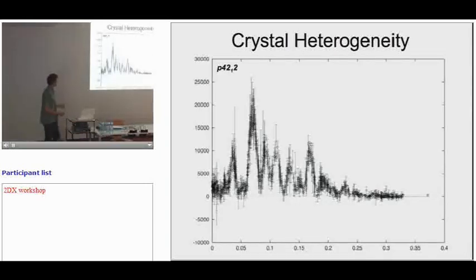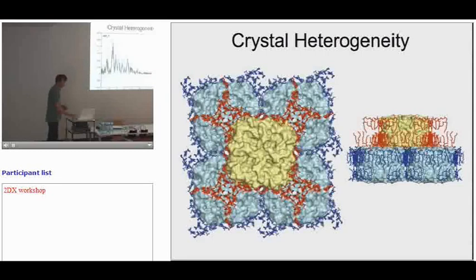And so this is what the merging lattice lines look like at the end. We're going to have a session on diffraction merging, I think Thursday, where you'll be shown how to actually make these lattice lines. But you can see how much better they are, that there's actually a modulation of the intensity with respect to resolution, whereas before it was just a smear. And then this allowed me to build this atomic model using molecular replacement, which I'm going to discuss more on Thursday. So how to take diffraction patterns and actually convert that into an atomic structure.